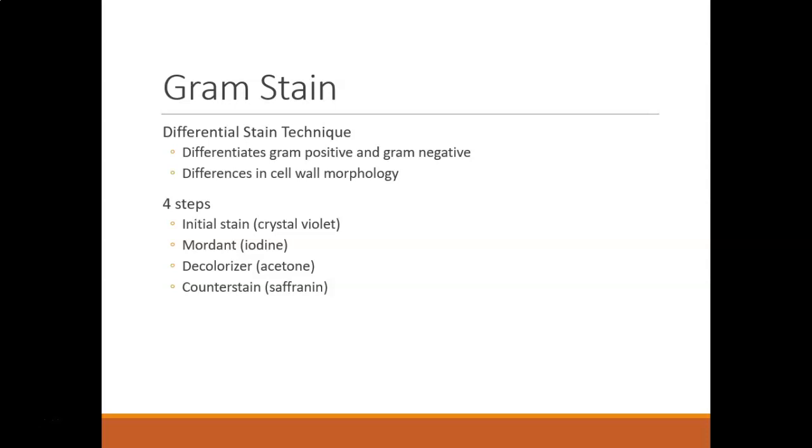After 1 minute, you rinse with distilled water again. Then you decolorize with acetone. I typically decolorize for about 30 seconds or until the slide runs clean. Typically 30 seconds is fine.